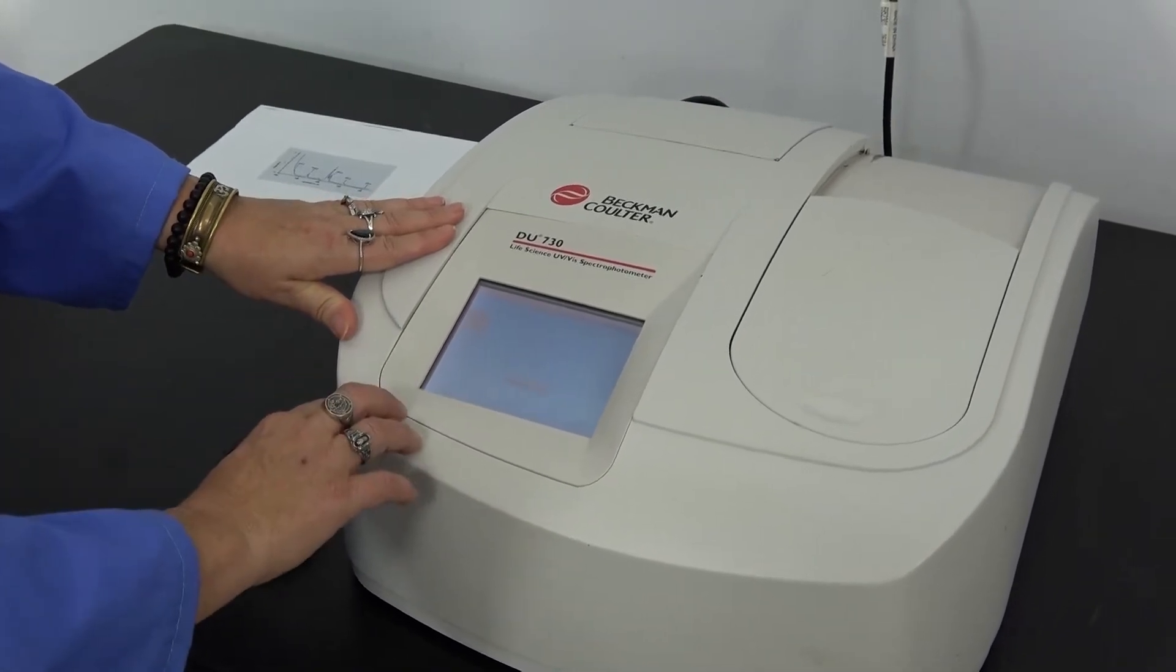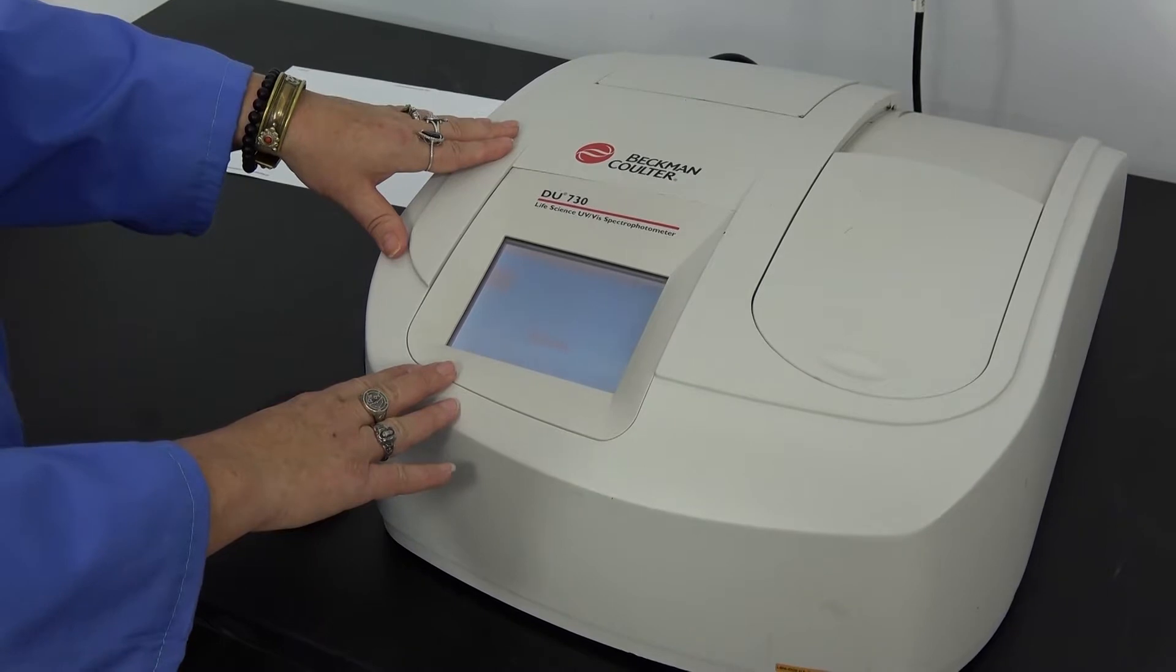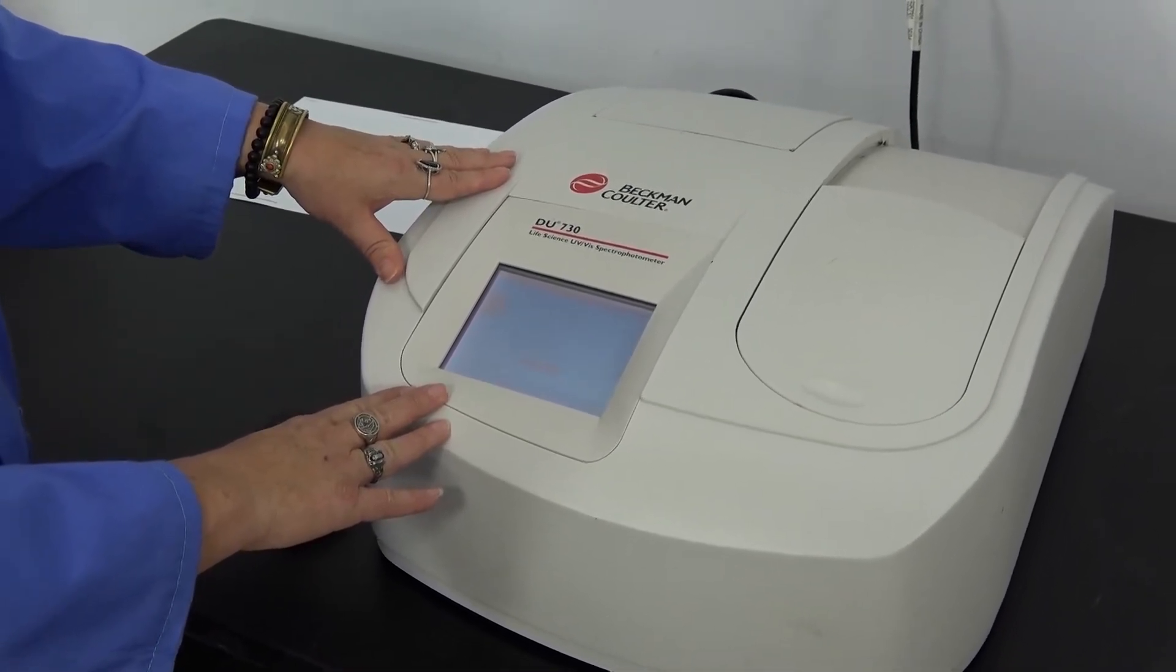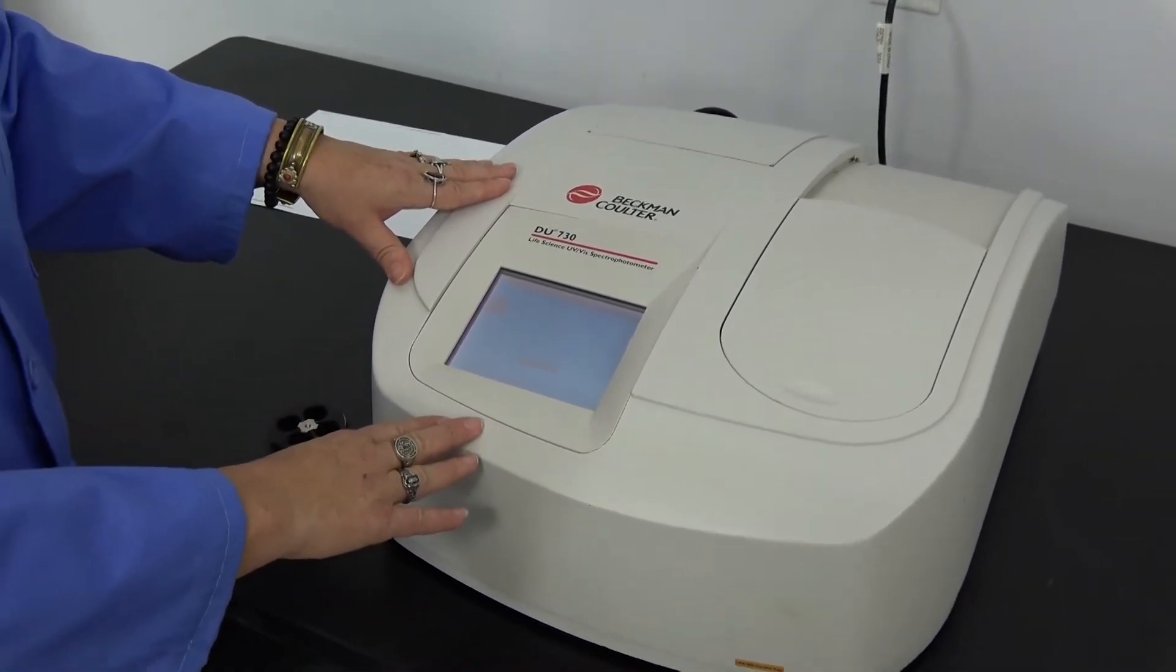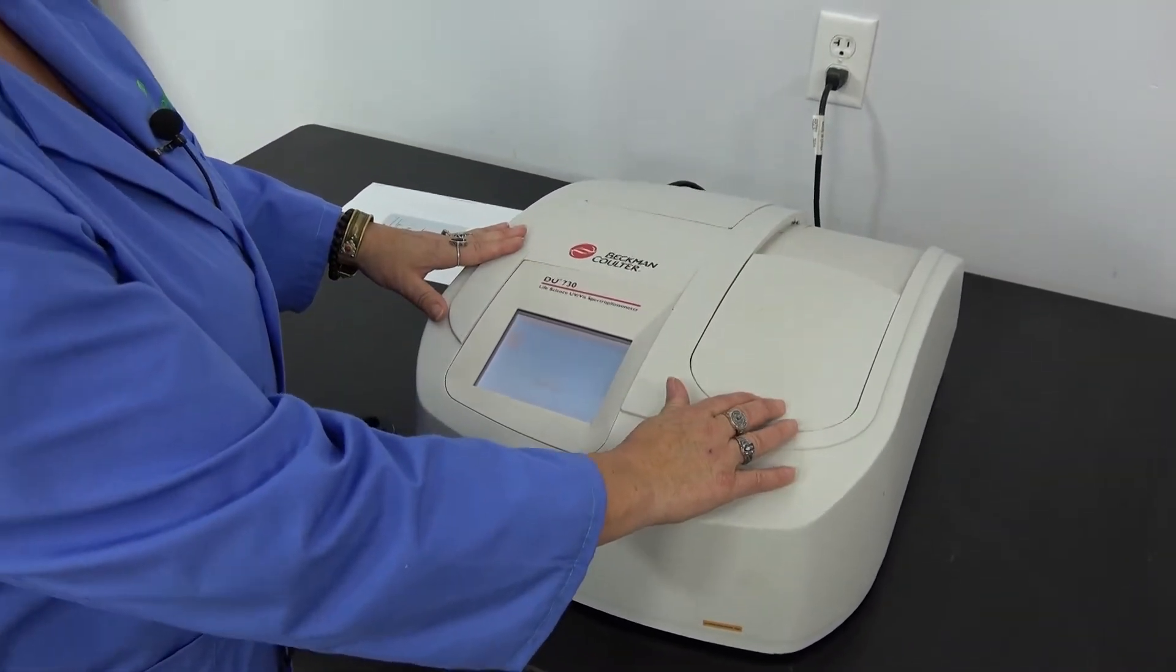It gave us the expected peaks on our Holmium. This data can be easily exported using a thumb drive and CSV file or utilizing plug-and-play keyboard and/or printers on the USB ports on the back.